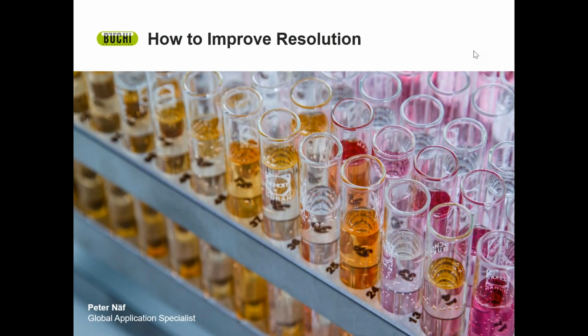Hello, everybody. Welcome to this webinar on how to improve resolution. We all face challenges to separate compounds as well as possible whilst doing our preparative chromatography. And in this webinar, we will learn more about how to improve resolution and fractionate our compounds more efficiently.